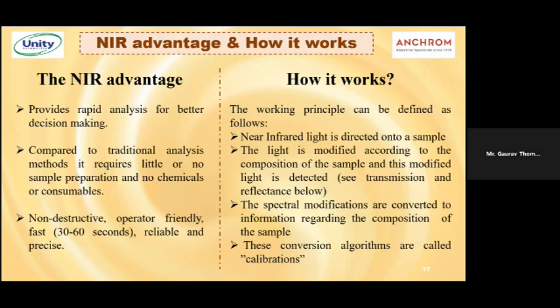How? By some non-destructive kind of analysis. Whereas your primary method completely destroyed your sample. It consumed your time. It also consumed your sample. Whereas the secondary method would only consume some amount of your time, and that won't be more than 60 seconds. So this is how NIR proves superior over the primary methods, and also saves your time, your chemicals, your energy, and other resources.